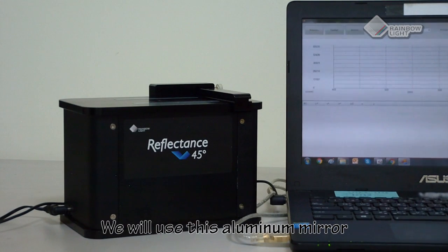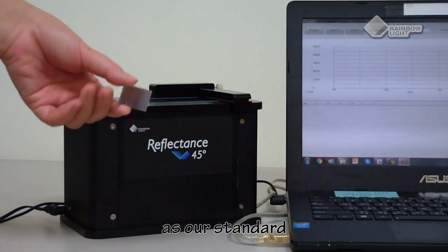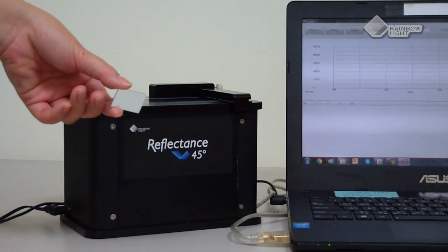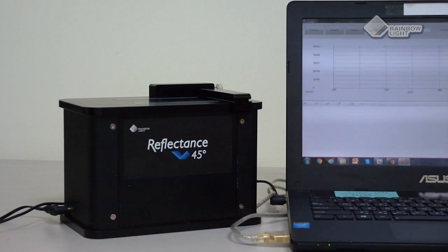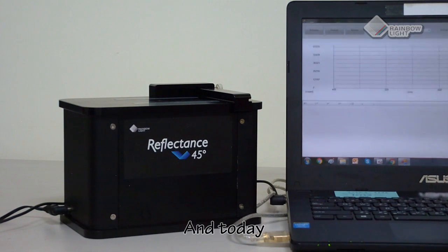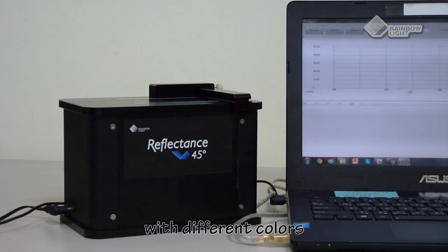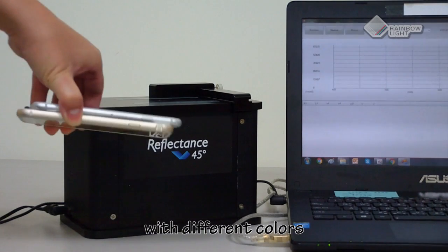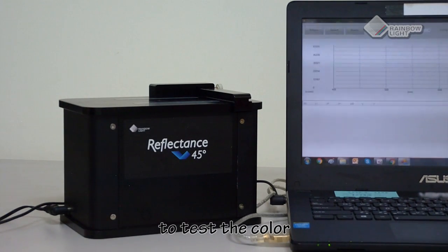We will use this aluminum mirror as our standard, and the measured value will be our reference. Today we prepared two different samples with different colors to test.